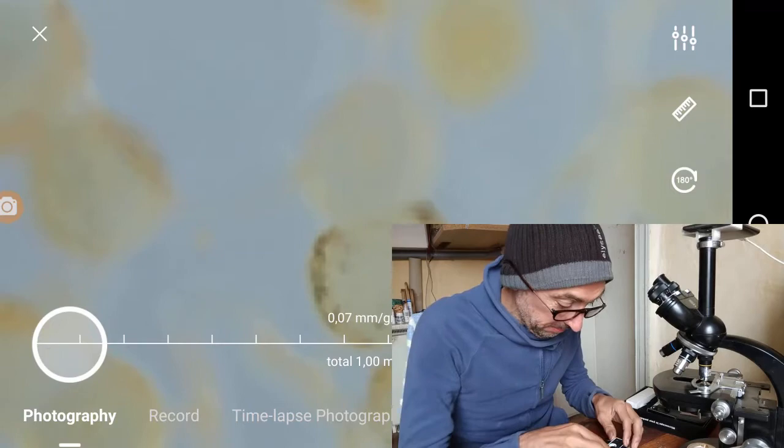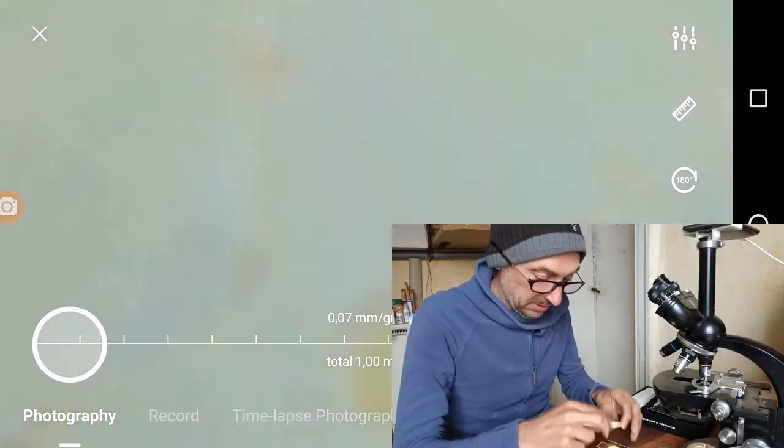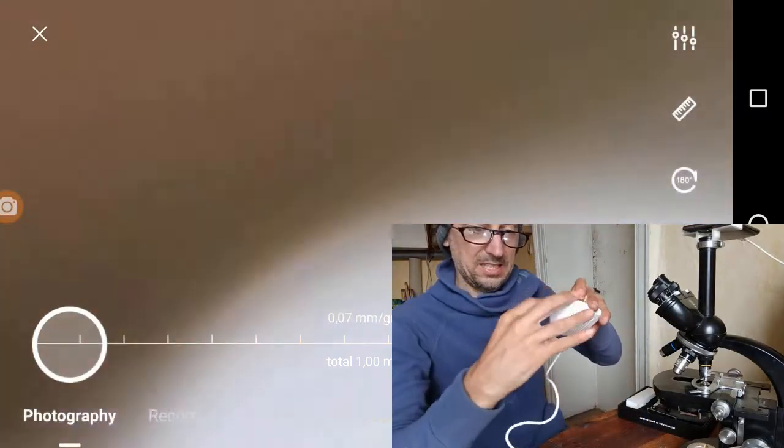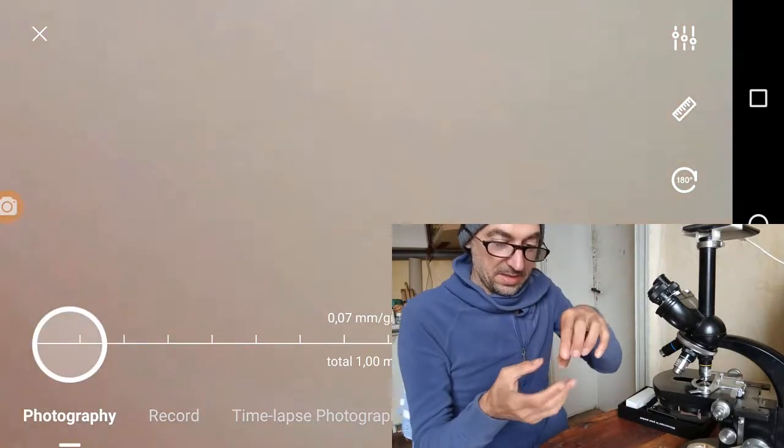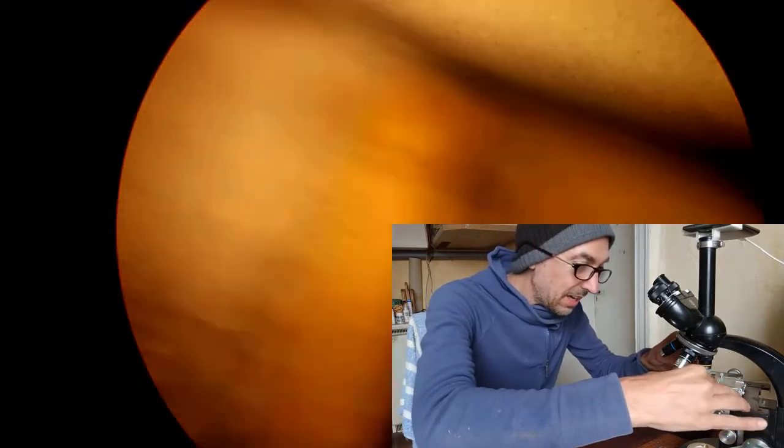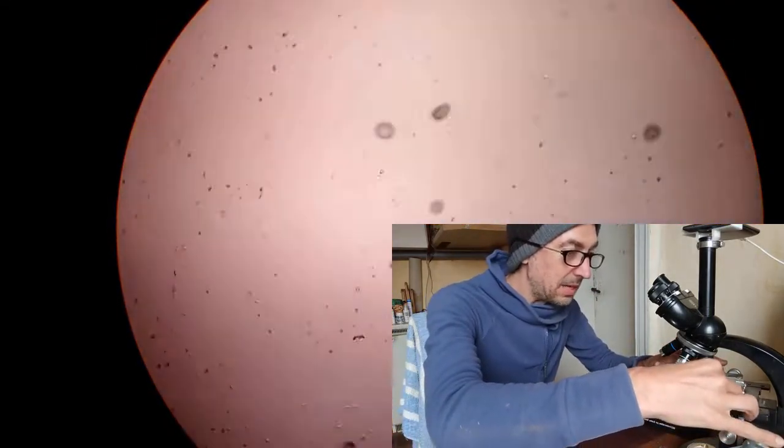you need dark field mode. I'm really excited - it comes right out of the box. Very nice - simply click it to the side and you're done. Now I have to put it on the other side. This is 10x.